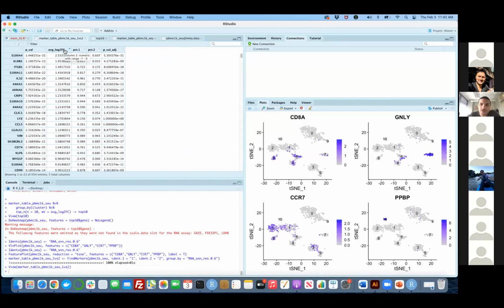So basically what I'm saying is that cluster 1 actually has a bit more, as opposed to 2, which was naive as we picked up. So this could be some CD4 T cells where KLRB is up and some S100A4 is up as well. So again, the annotation is up to you.